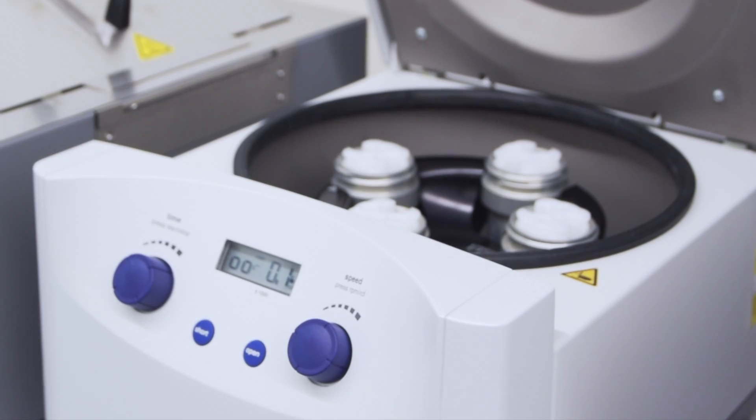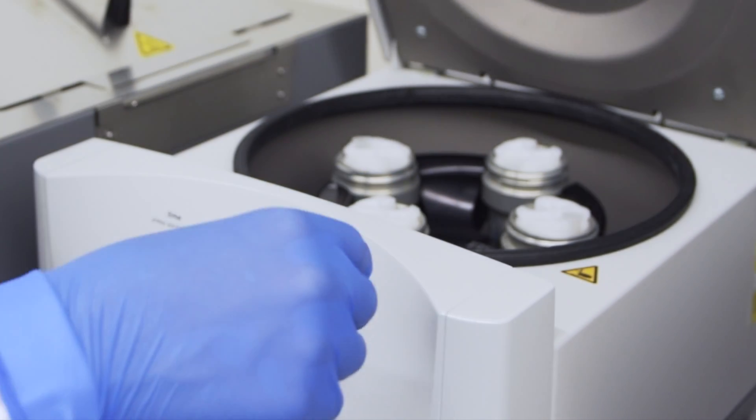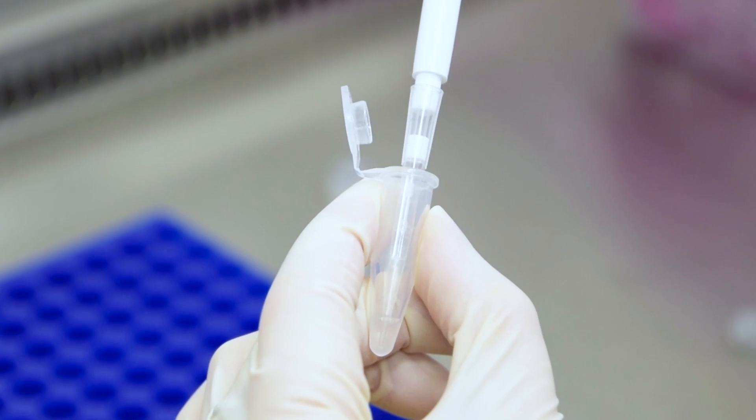Transfer the required number of cells into a tube and centrifuge to obtain a cell pellet, then re-suspend the pellet in the ink by pipetting up and down.